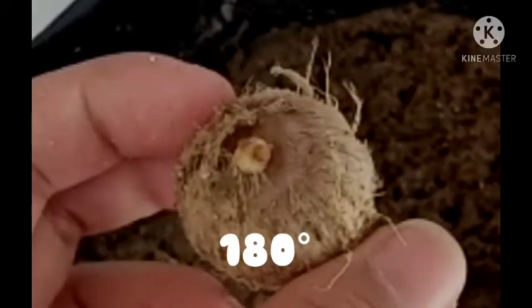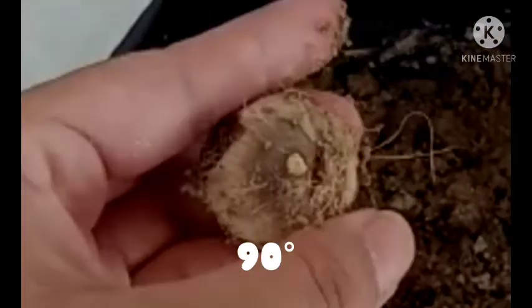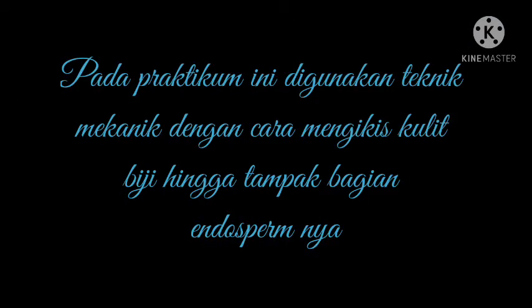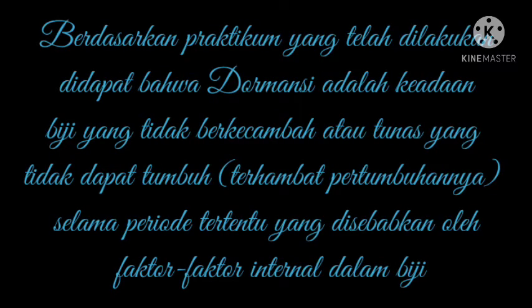Hasil. Pada praktikum ini, digunakan teknik mekanik dengan cara mengikis kulit biji hingga tampak bagian endospermnya. Pada praktikum yang telah dilakukan, didapat bahwa dormansi adalah keadaan biji yang tidak berkecambah atau tunas yang tidak dapat tumbuh atau terhambat pertumbuhannya selama periode tertentu yang disebabkan oleh faktor-faktor internal dalam biji.